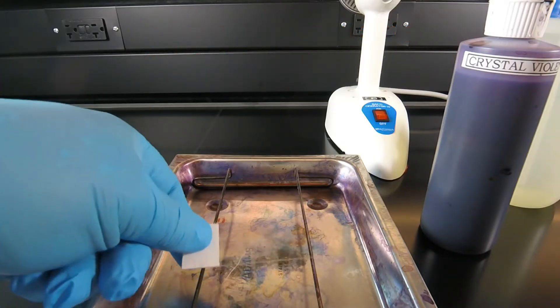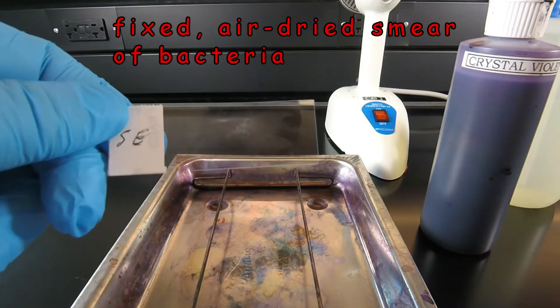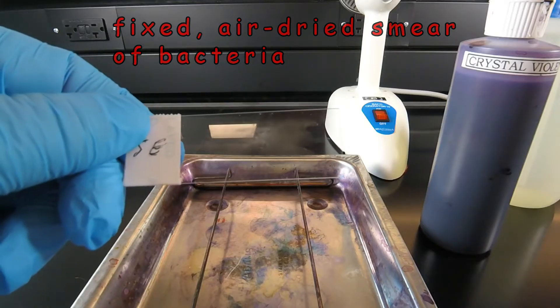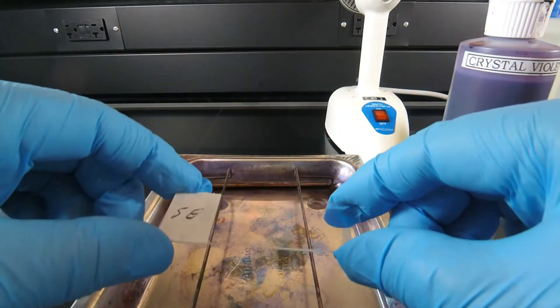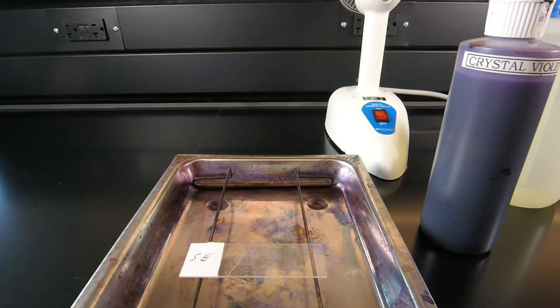We have an air-dried smear of bacteria that's been fixed to the slide. We learned how to do that in a previous video, and we're ready for the actual staining. So we set our slide on the staining rack.